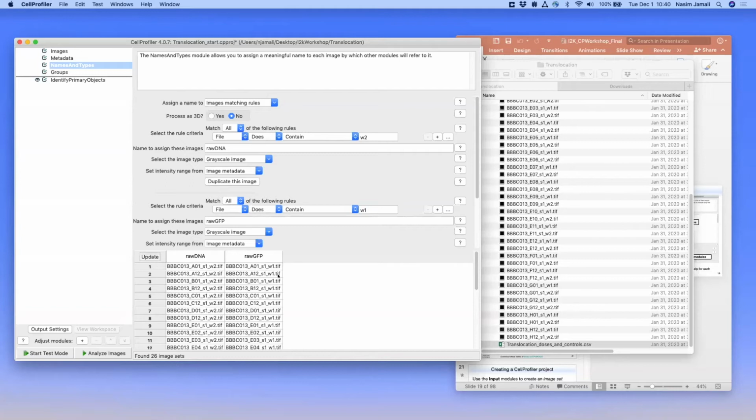So for CellProfiler, for however many channels we have in our data set, we want to make all of those as one. We call all of those together one image set. If I have 2 channels, those 2 channels are my one image set. If I have 5, those 5 channels are my one image set.